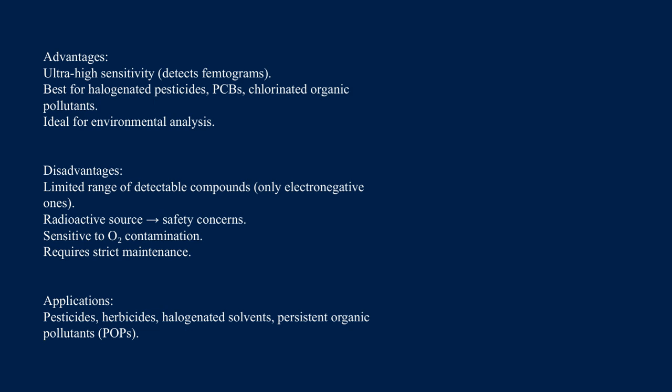In terms of applications, this technique is particularly valuable for analyzing pesticides, herbicides, halogenated solvents, and persistent organic pollutants, often abbreviated as POPs. These are all significant in environmental monitoring and regulatory compliance. Overall, while it has some limitations, its high sensitivity and specificity make it a powerful tool for environmental analysis.